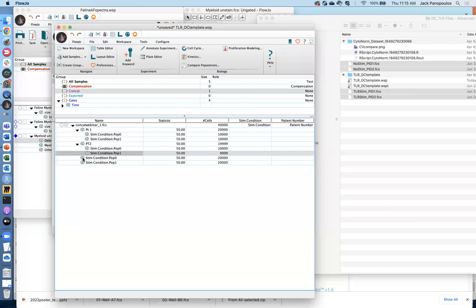Kauthar, we don't know exactly when Traxum will be available. So far, I haven't gotten even a test plugin in my hands yet. So I'm hoping that it's going to be done by the end of the summer, maybe sooner. But we will definitely have a webinar when it becomes available. We'll show you how to use it, etc.